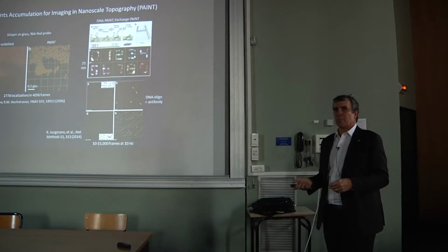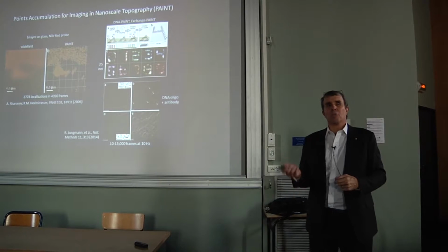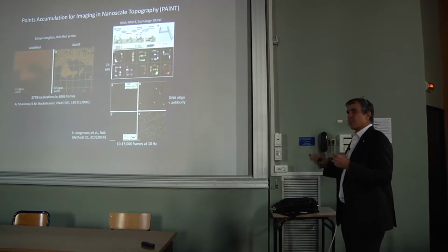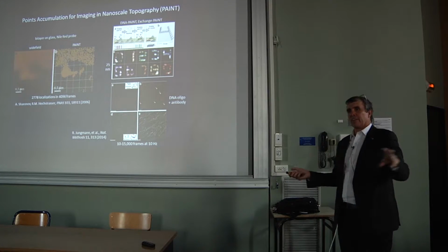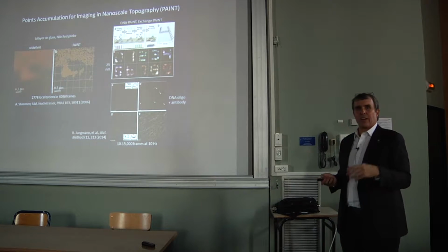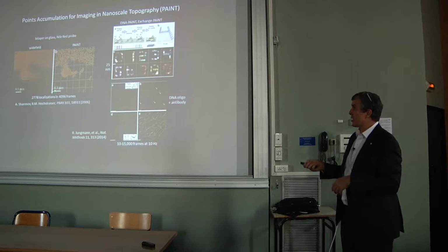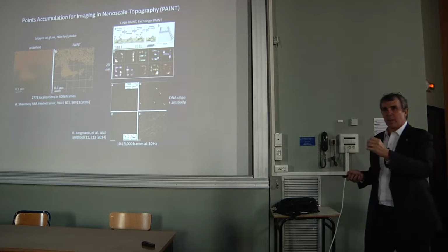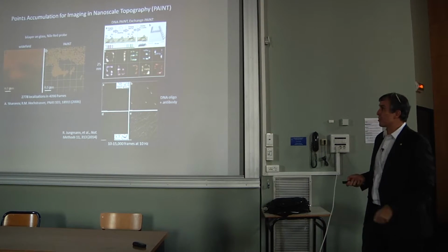But there's another method of super resolution that came out in the same year as our PALM paper, which works differently. It's called PAINT. The molecules are actually in the cell media, not in the cell itself initially. Normally they're whizzing around so fast under their Brownian motion that you can't see them at the capture rate of the cameras. But when they stick and bind to their targets, then they're fixed and they're a little glowing star, and then you can localize those.